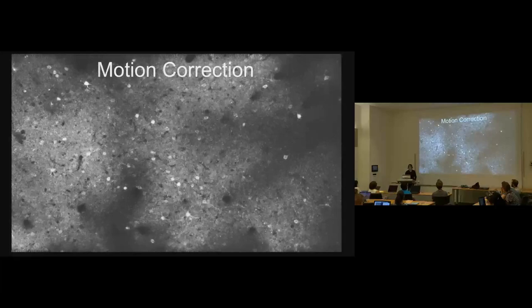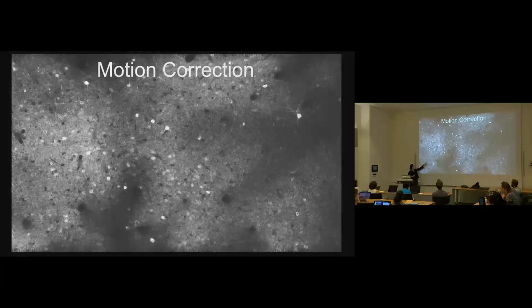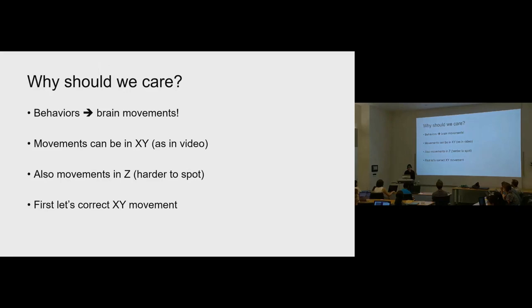Here's an example of an uncorrected field of view that we'll be processing this afternoon. You'll see how we can motion correct it and get rid of both rigid movements and also non-rigid movements, where different parts of the plane move in different directions.